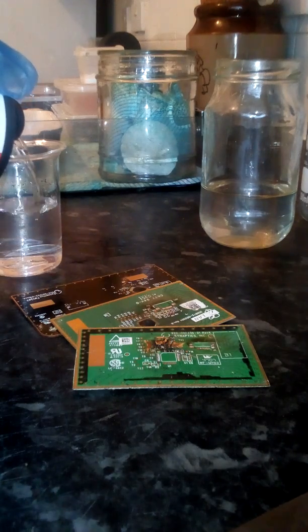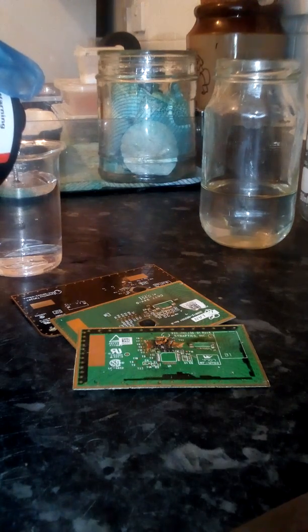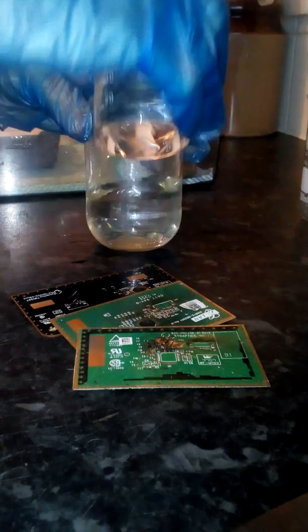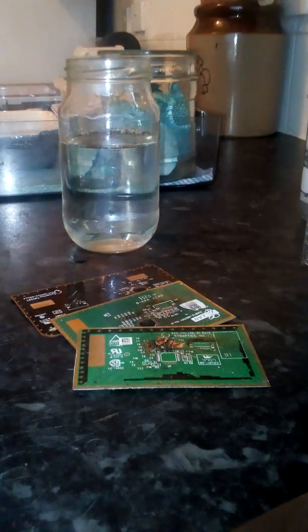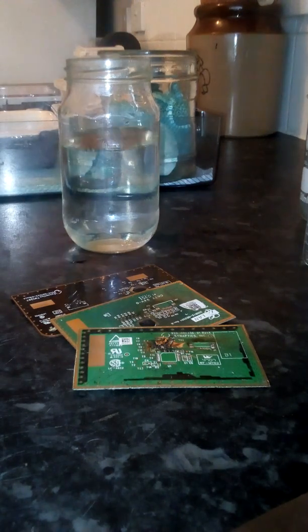Now for the peroxide — I haven't got too much left of this. Another few recoveries before I have to get more, but it's lasted a major amount of time. Mix them up with a glass stirring rod, a little mix.